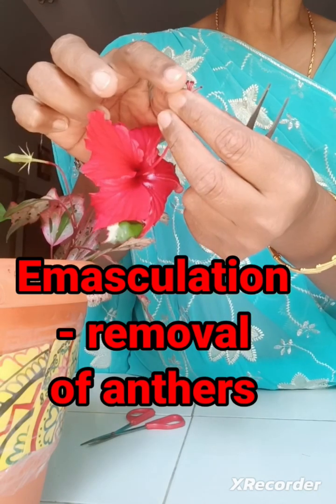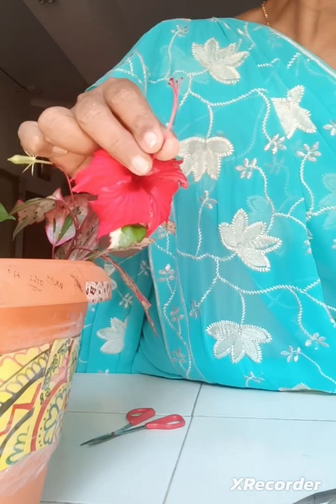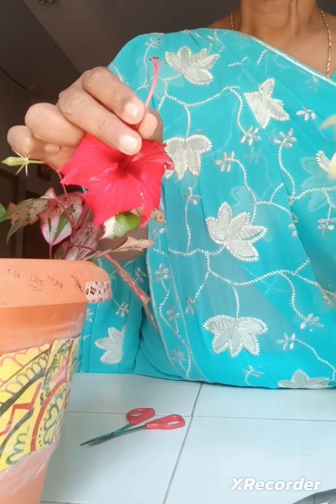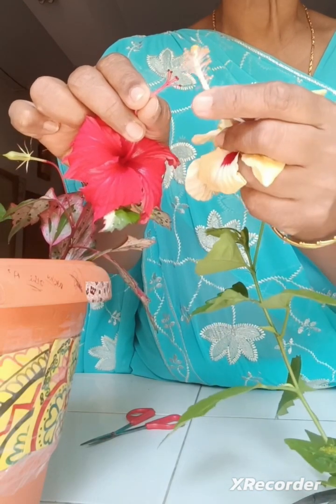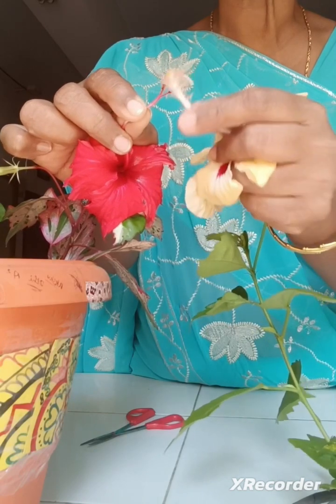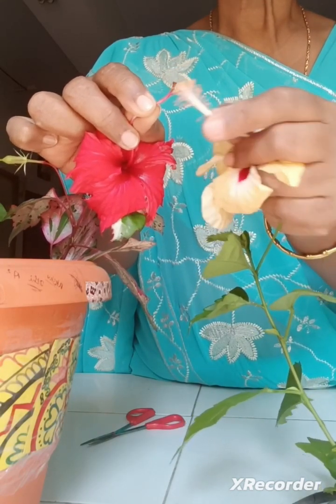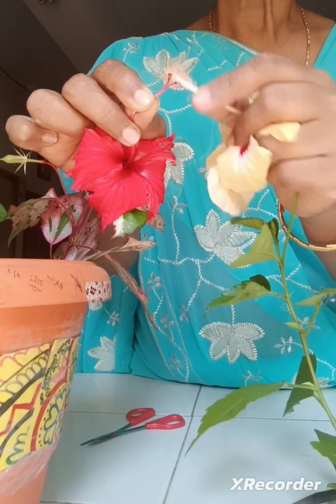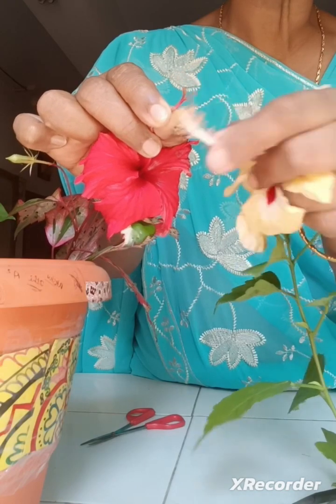Upon the stigma, we can dust the pollen grains of the desirable quality flower. Now I am dusting the pollen grains upon the stigma of the first flower where emasculation was done. The pollen grains are transferred to the stigma by means of artificial cross-pollination technique.